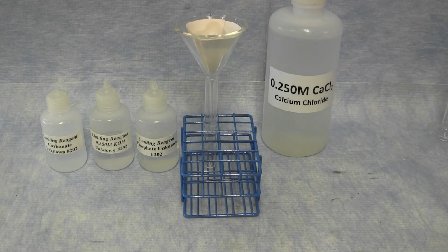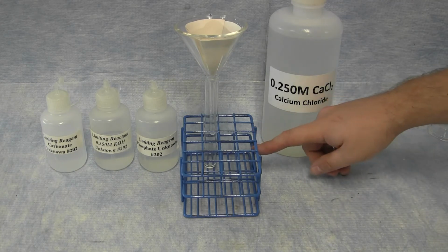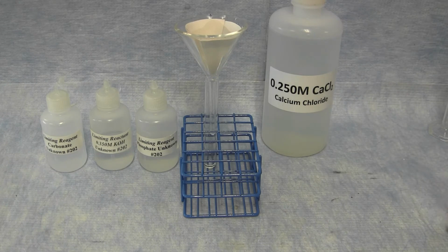As the liquid passes through the filter paper, all or most of the precipitate should be contained in the filter paper, and only the clear liquid should be passing through into the test tube. This liquid is the filtrate of the reaction.